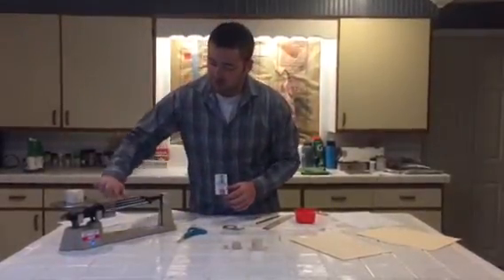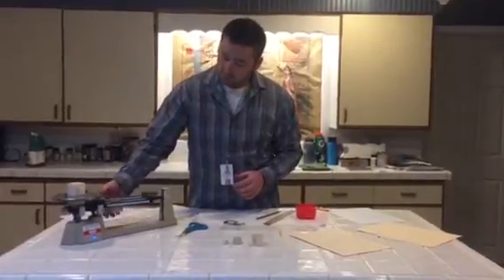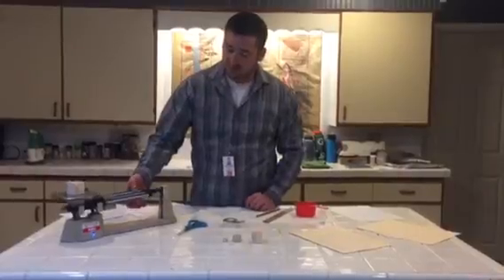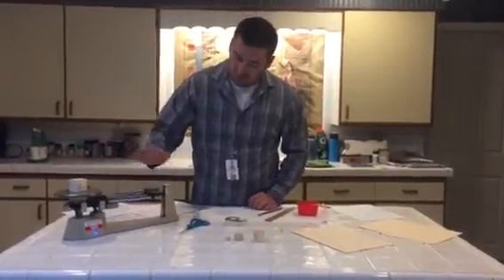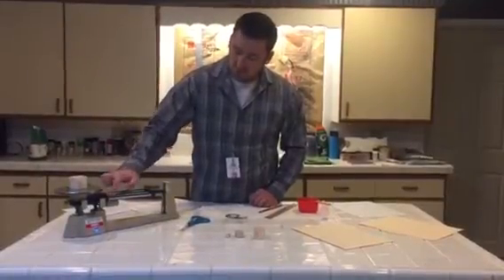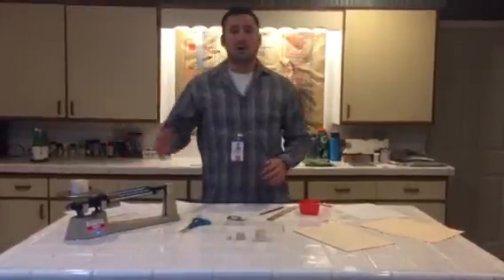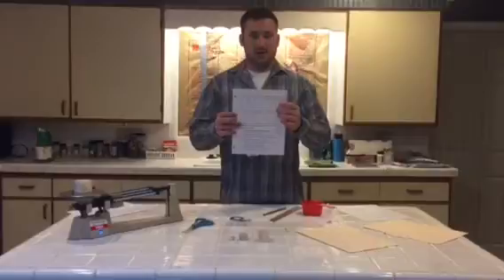I'd instruct them to start with everything to the right, use the big one first, and then if it's too far, use the second biggest, and then you decrease until it teeters. Then use the small one to get your smaller digits. We would record that in grams in the far right column, in grams.